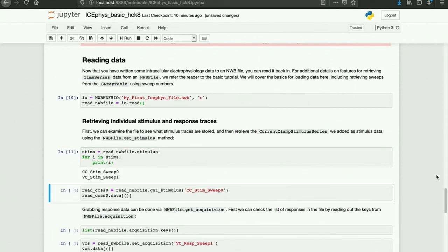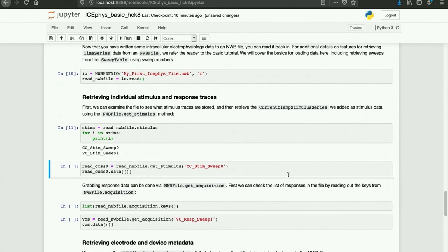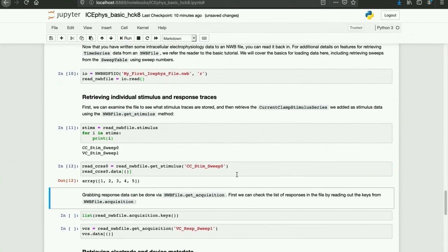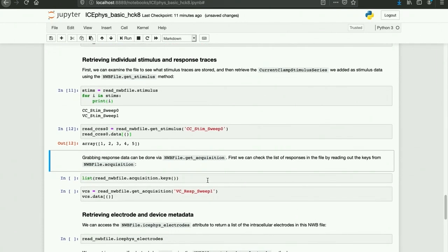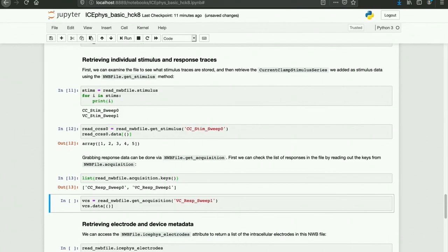There is a list of the available stimulus sweeps, and there is the data from current clamp stimulus sweep zero that we had loaded in. Grabbing response data can be done via the method NWBFile.getAcquisition. We can check the list of available responses in the file using NWBFile.acquisition, and then we can take the name of one of the traces to read that response trace back in and look at the data.